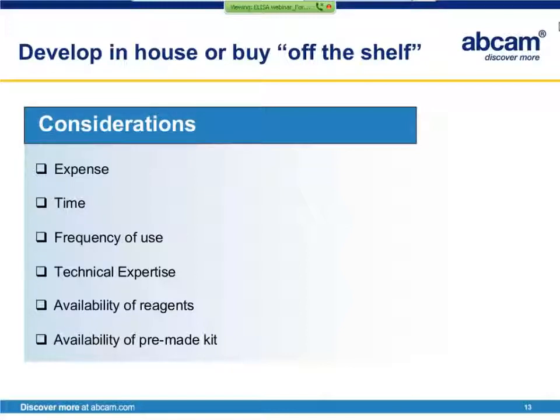Frequency of use relates to expense. As I mentioned, if you will use this ELISA assay frequently, definitely consider developing an in-house assay. Then again, if time is critical or if money is plentiful, then you should consider purchasing the off-the-shelf kits.